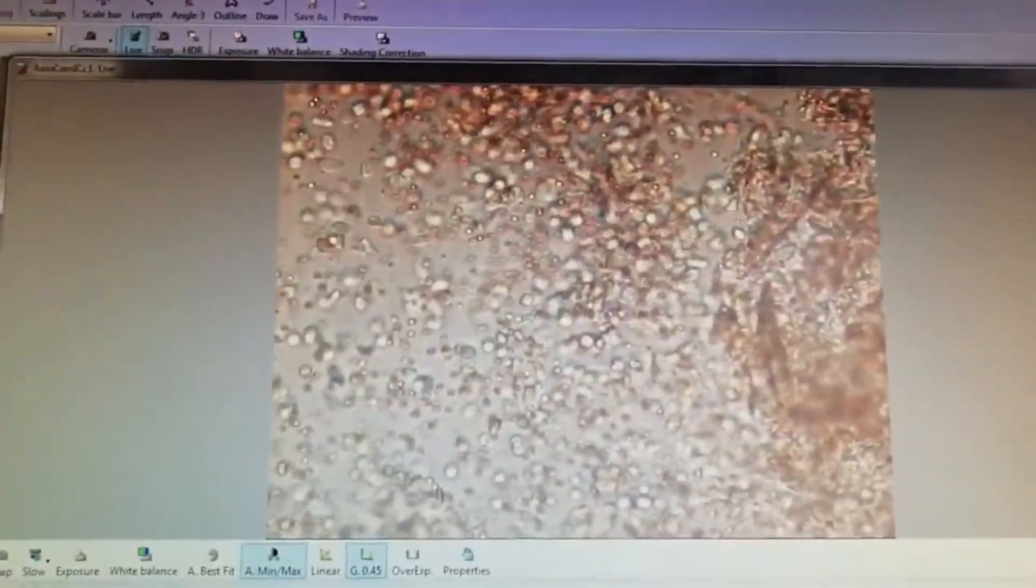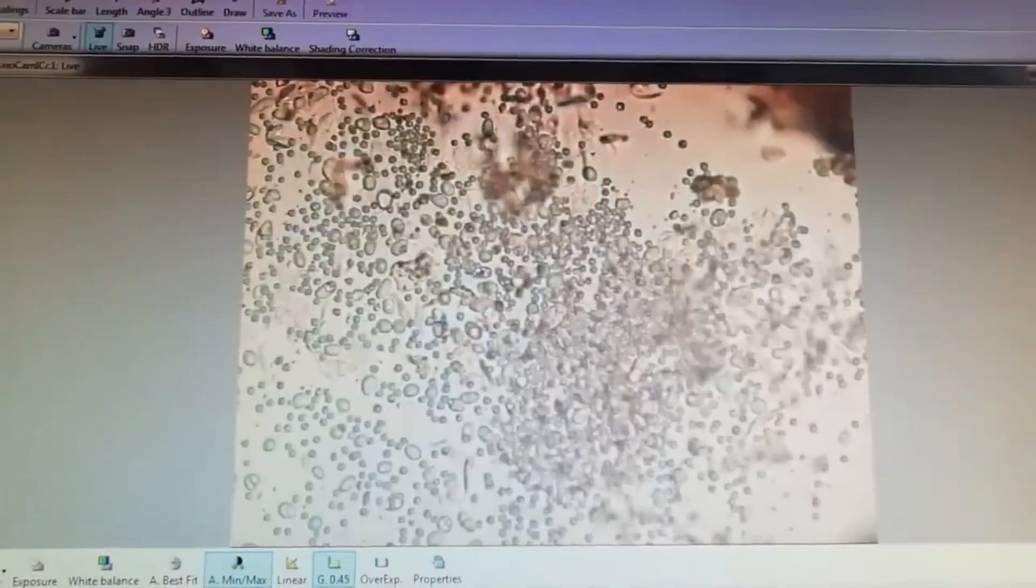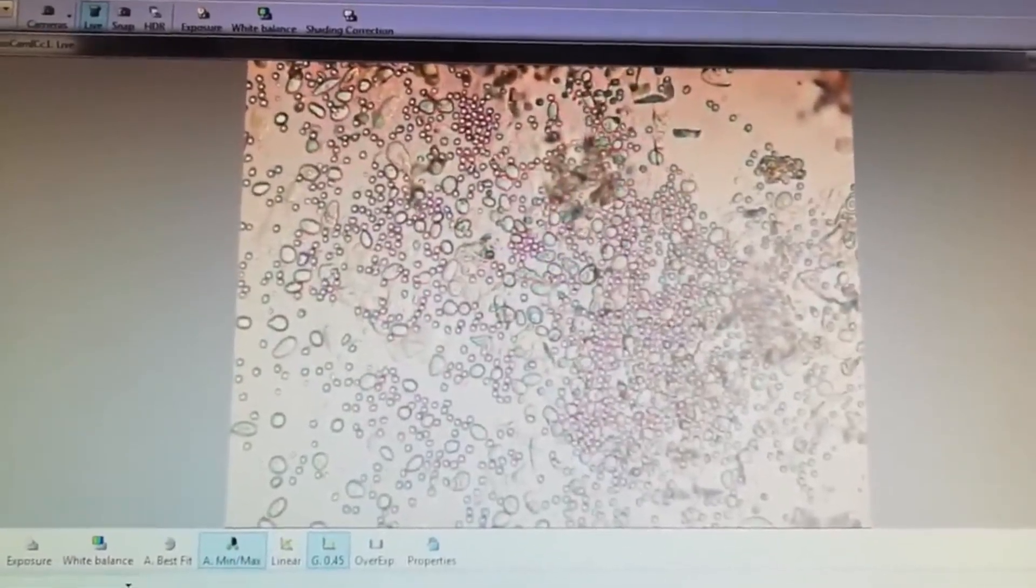Next, it is showing metestrus phase. In metestrus phase you can see here the cornified cells are mixed with leukocytes.